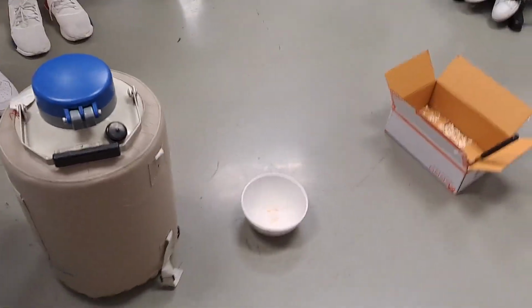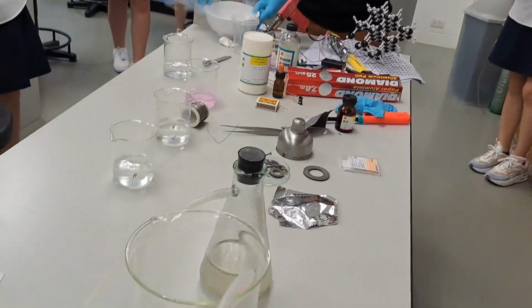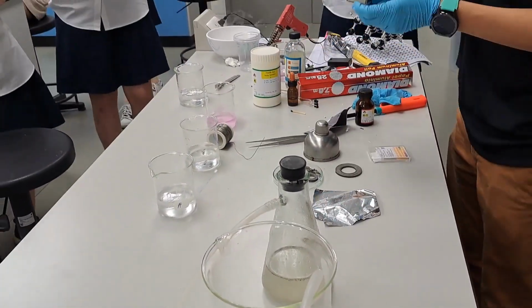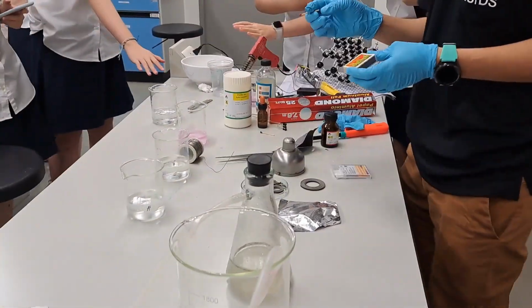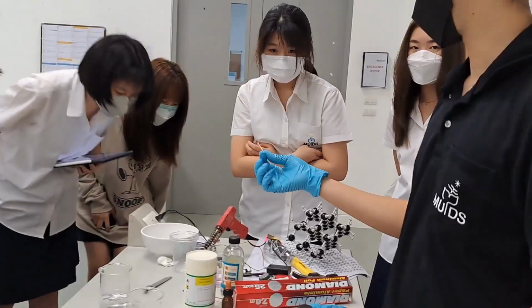One more demonstration for group 5. Back to the center, please. Let's take this up so no one steps on it. And a hot shower with liquid nitrogen. A very cool shower. Cold, not cool. Cold. So here, a matchstick. You can grab the bowl from outside.